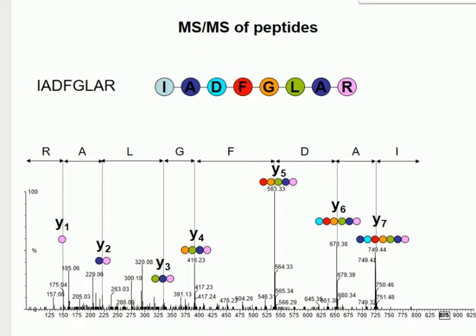If you had this peptide and it was doubly charged, so two protons on it, one of the protons would still sit on that arginine because it's still the most basic residue. But the other charge would have to go somewhere, right? And the most likely place is the N terminus, because that nitrogen at the N terminus is the next most basic place. So then, when you've got fragmentation here, this is doubly charged, so you've got a charge on the B2 fragment and a charge on the Y6 fragment, and you'd likely see them both. Okay?